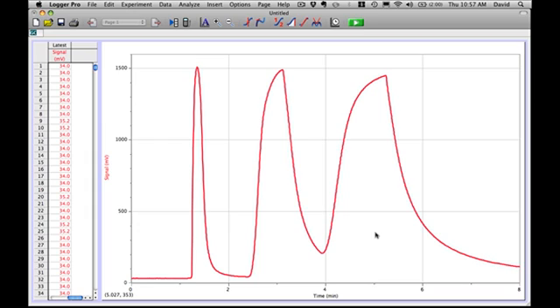But we have a graph that we can analyze and take the first step in identifying our substances and give you a good example of how the data are graphed and then analyzed after the experiment with our Logger Pro software.